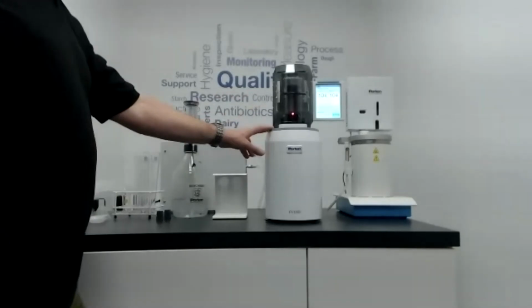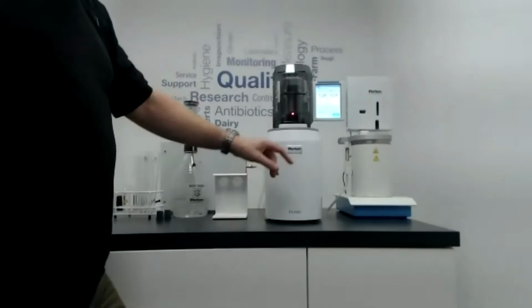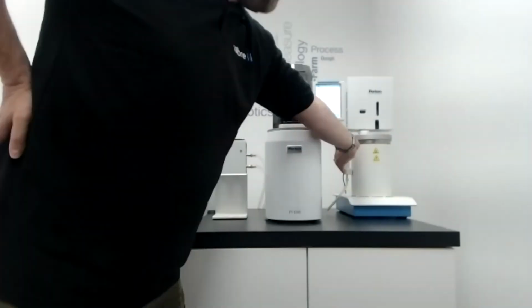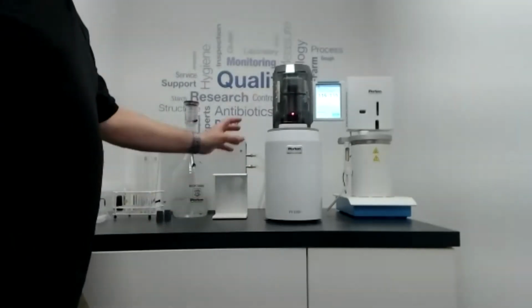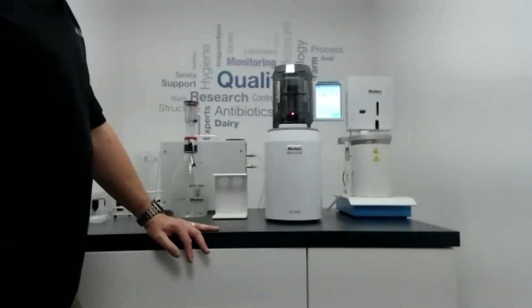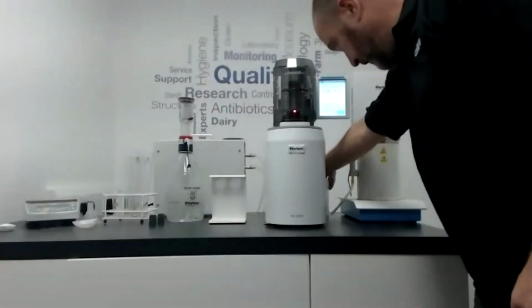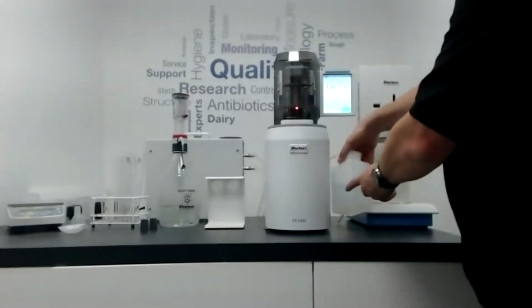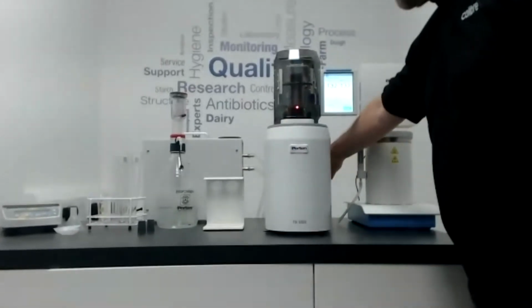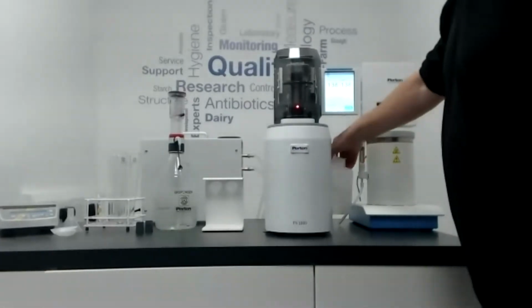I don't know if many of you have seen this new Falling Number 1000 model. You'll notice the difference is it doesn't have an external water level control like the one that we've had in the past. It's got an inbuilt level sensor and automatically adjusts the water in the bath via a sensor inside itself, and it uses an external reservoir to either top up the bath automatically or to empty itself automatically. And again, you need to make sure this is filled up every day.